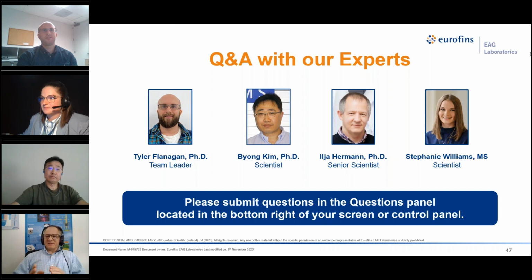So let me take this question. There are clear definitions on nanoindentation. Per definition, nanoindentation goes to anything shallower than 200 nanometers. That's based on the ISO 14577. So anything above is then microindentation.